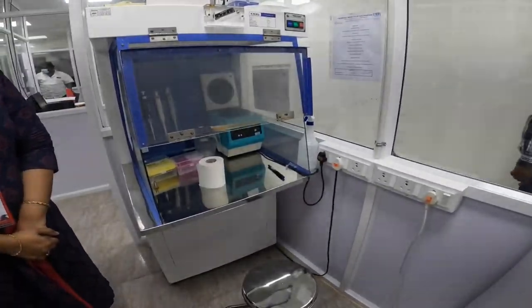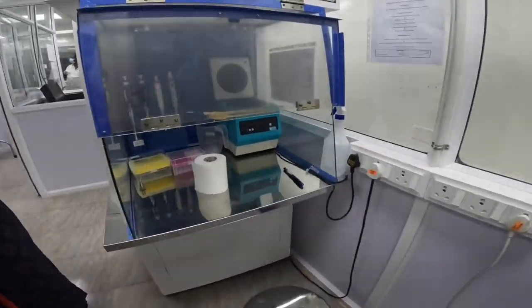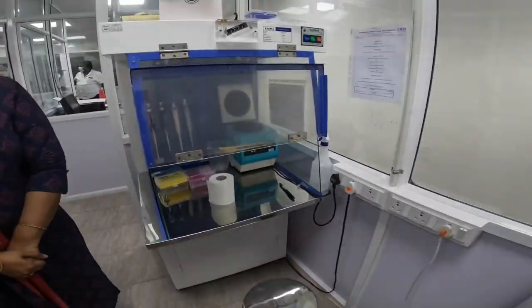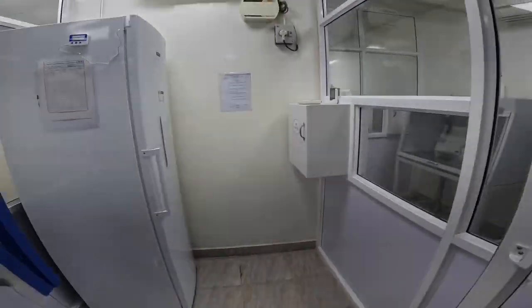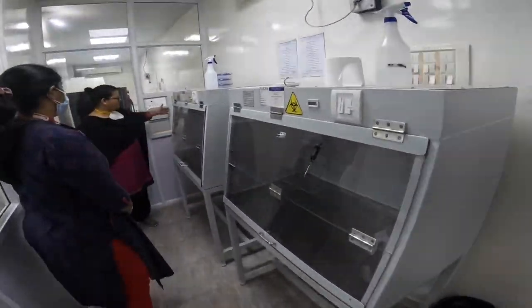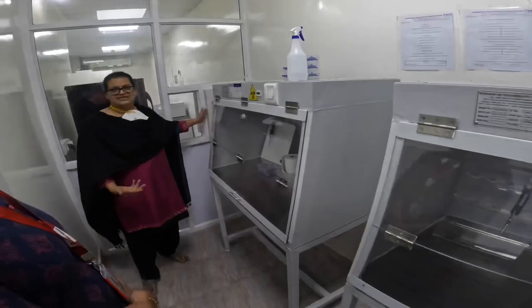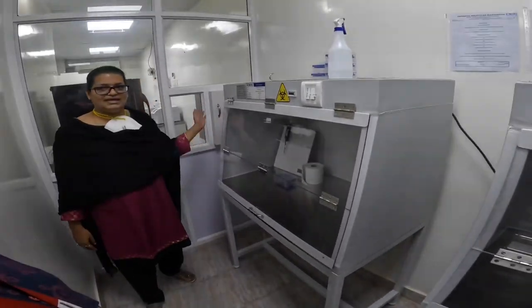This is the most important step, which we call the master mixture preparation room, and this is how they have designed it in this particular laboratory. These laboratories were usually called molecular genetic labs previously, and after this COVID pandemic, all these molecular labs are used for doing RT-PCR for COVID.